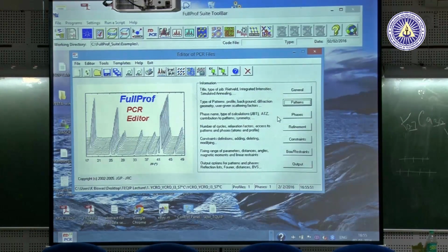I have a question. Like if I have two phases? If you have two phases and you are really interested in doing the fitting, I already told you can fit simultaneously 16 phases, with FullProf. It will be so complicated, right? So what is a good strategy? Let's stick to, I will show the 3 phases. Okay, 3 phases.